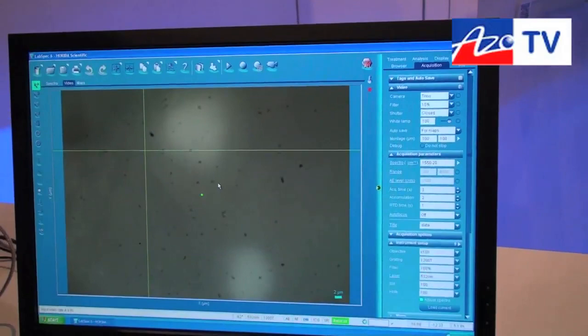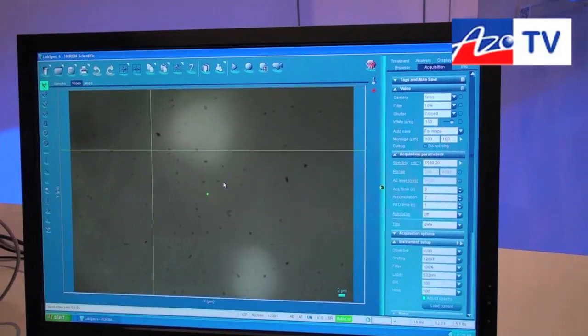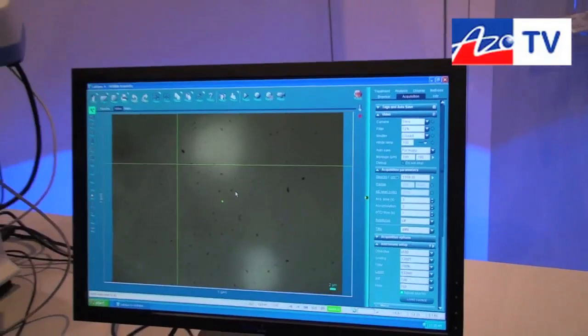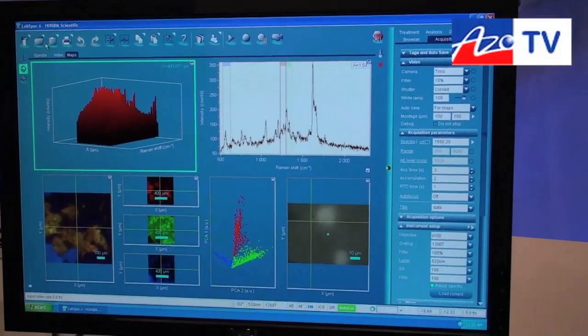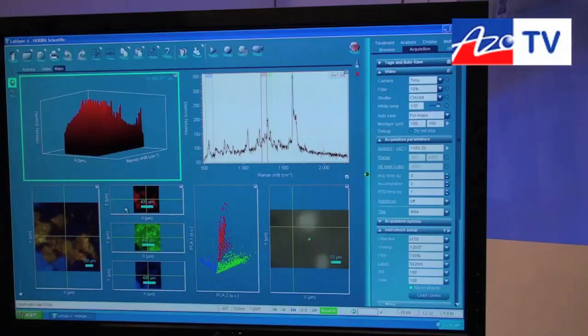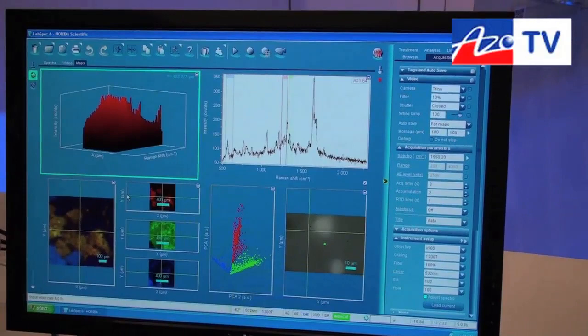We are measuring in depth and we are seeing what's actually inside the sample and not only on the surface. You can do this automatically, moving the stage automatically and produce 3D information like what we can see here and exploit this 3D multi-spectra to make a very nice picture illustrating the distribution within the sample whether it is at the surface or in depth.